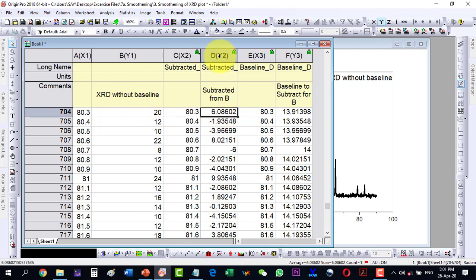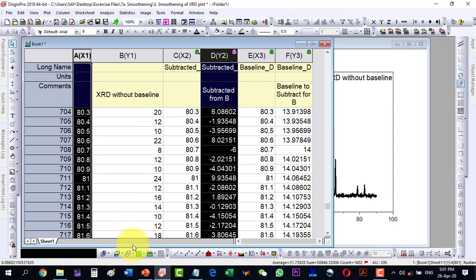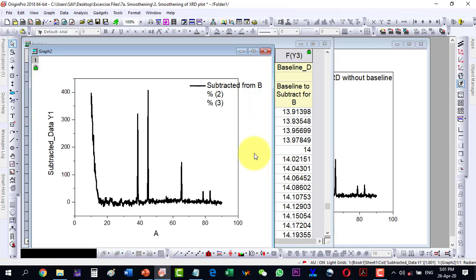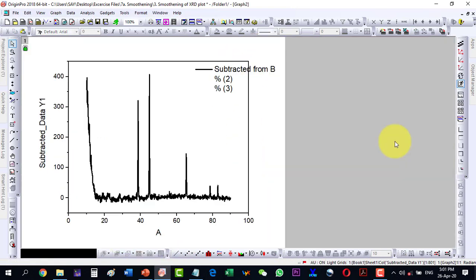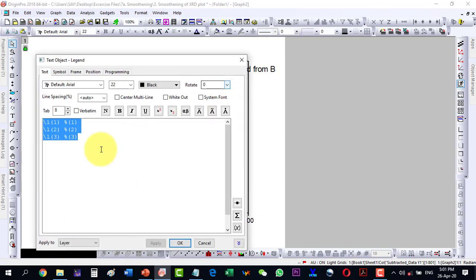This is my XRD plot. So I select this one and this one, and I do plot it. And now this is the baseline corrected plot. Double-click this one and remove the extra legends.